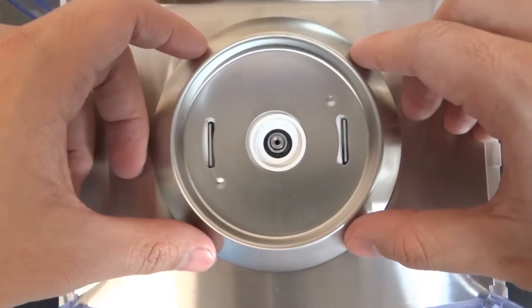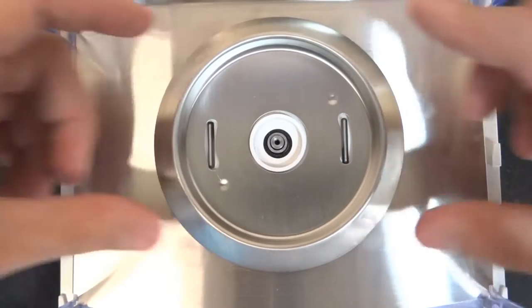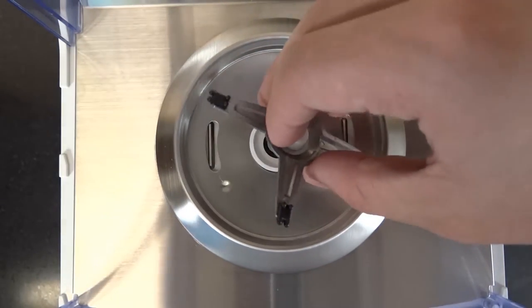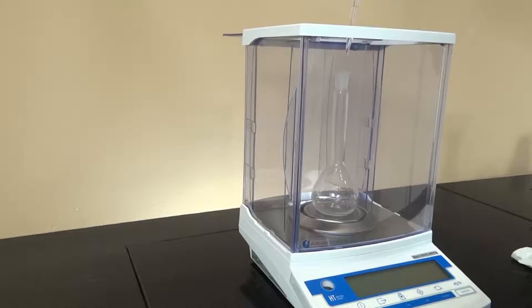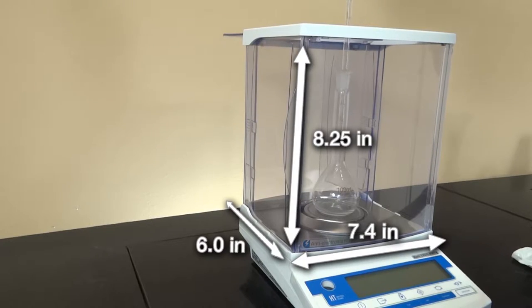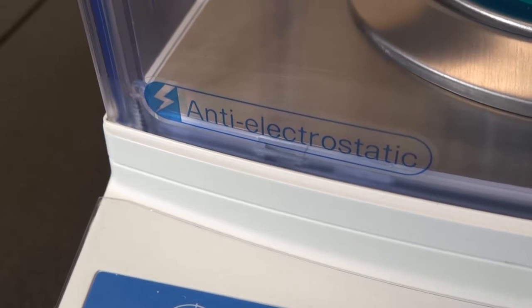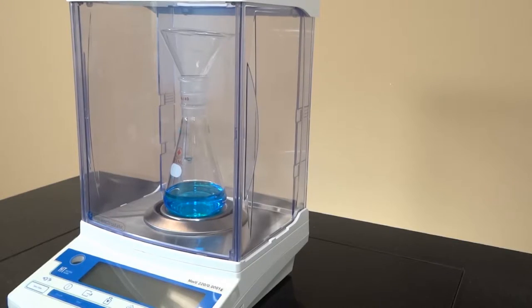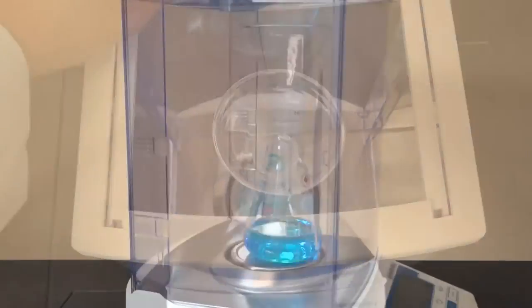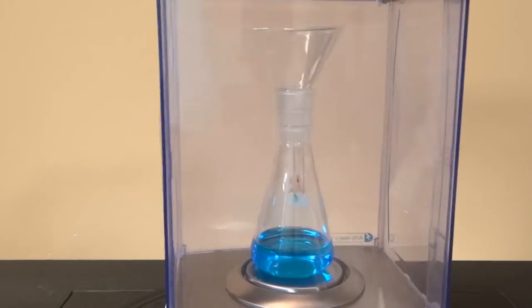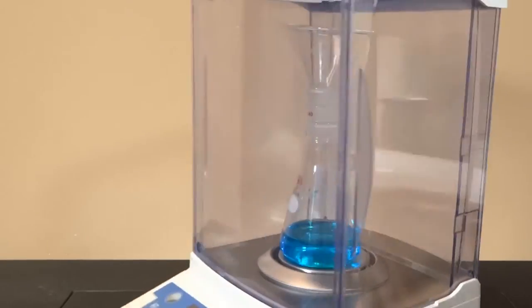The HT has an anti-buoyancy plate to prevent air currents from interfering with the weighing results and a 3.1-inch diameter platter. The HT has a spacious weighing chamber with three anti-static draft shield doors and offers plenty of room for large samples or pipettes. The weighing chamber also allows viewing from all four sides and from the top.